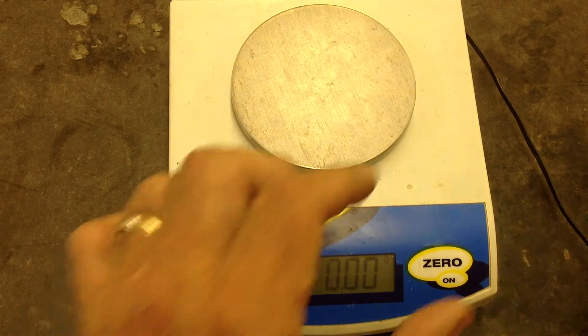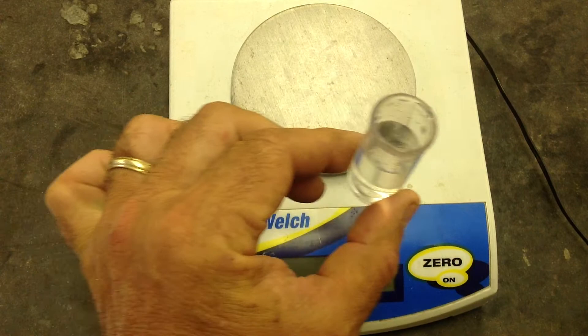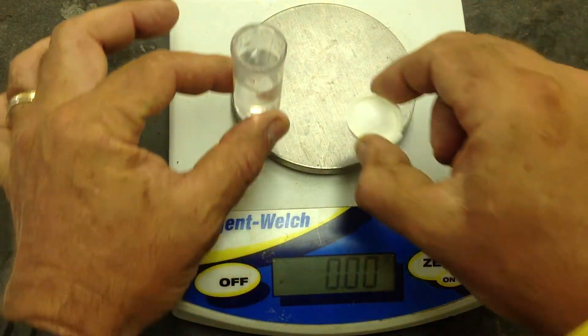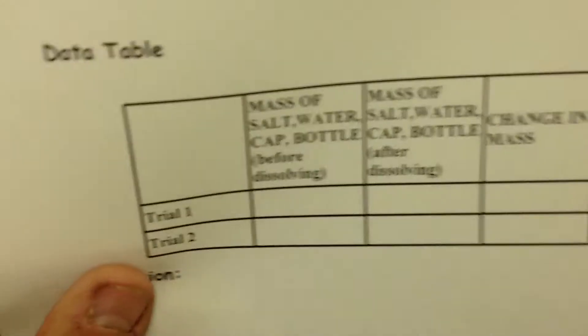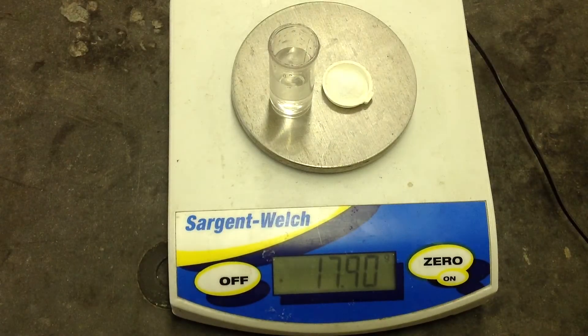We'll start out with a bottle of water. We will have a cap with 2 grams of salt in it. We will mass both of these together, but unmixed on the scale, and then record the mass on a data table that looks like this. It says mass the salt and water cap before dissolving — we'll write that down.